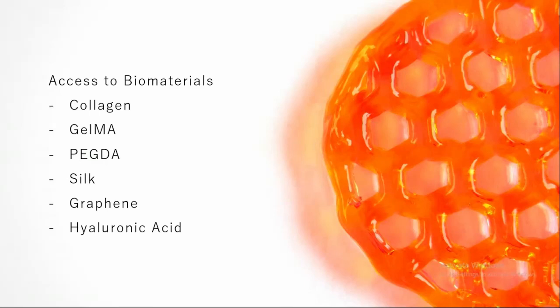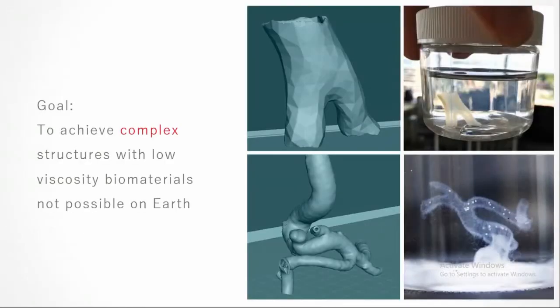And so that's really the goal, because what is the goal of all of this? I think part of it is understanding what the constraints are and what the values are of doing experiments within microgravity. Microgravity is a very unique environment. It brings about unique properties. And just as we've had to do with bioprinting here on the ground, where at the beginning we didn't understand all the constraints and values of being able to print and pattern cells, we've come a long way to understand that through scientific experimentation and repetition.